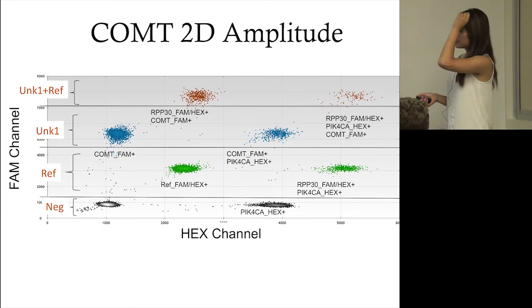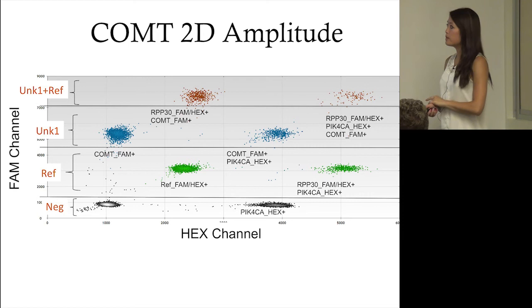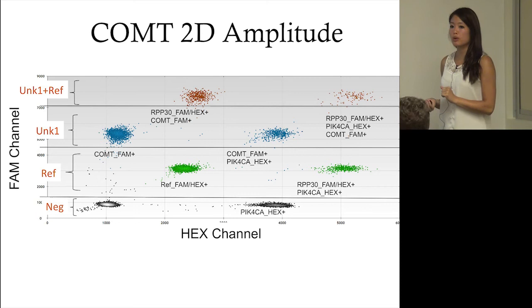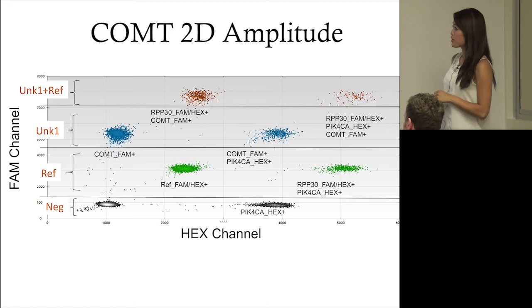Here I'm thresholding this 2D amplitude plot for COMT. You see the five clusters mentioned in the previous page, and new clusters have come about depending on the different proportions of probes in those clusters. It's really easy to threshold these clusters because they're very discrete and defined.